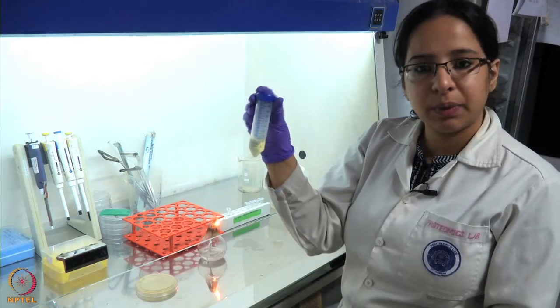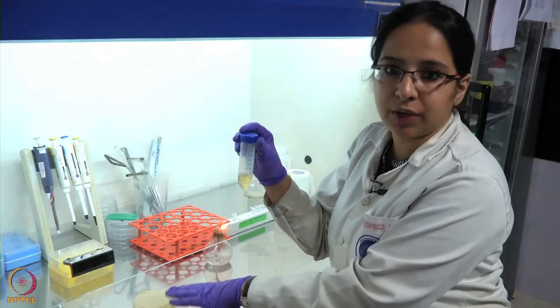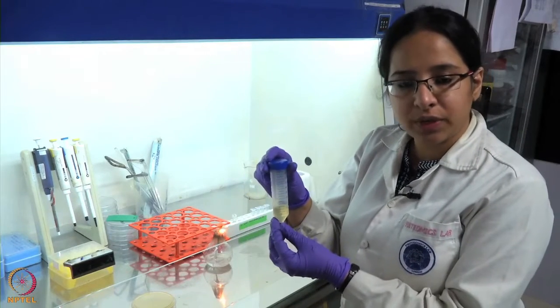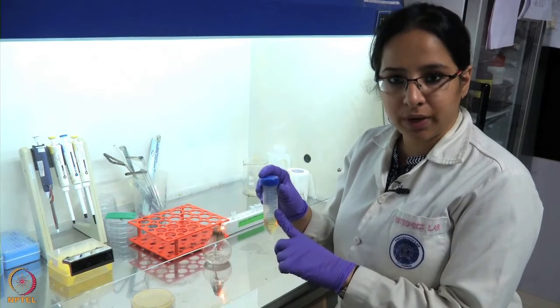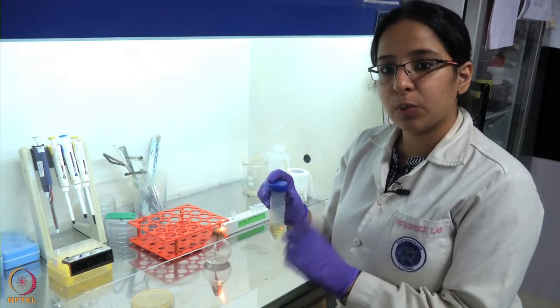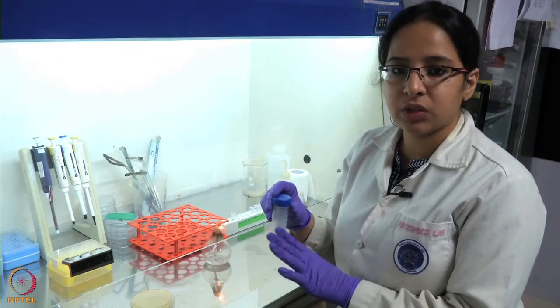So this is an LB media. This is the same media which is already in the solidified form in this agar plate. So this LB media has all the components which are required by the bacteria to grow. So we'll pick up a colony and add it in this LB media. We'll also add our antibiotic, the antibiotic for which the resistance gene is already present on the vector, so that only our vector grows and no other contamination is seen.